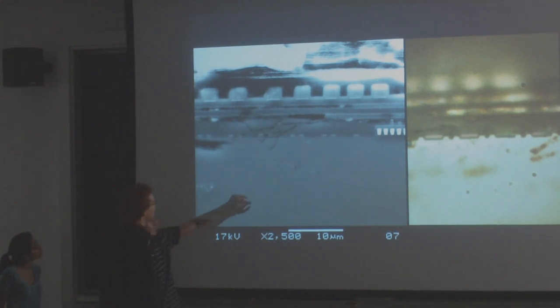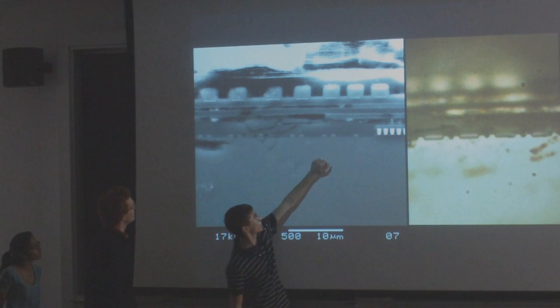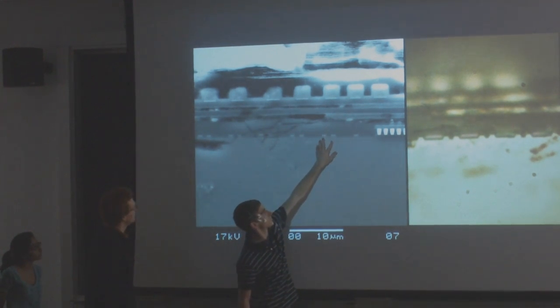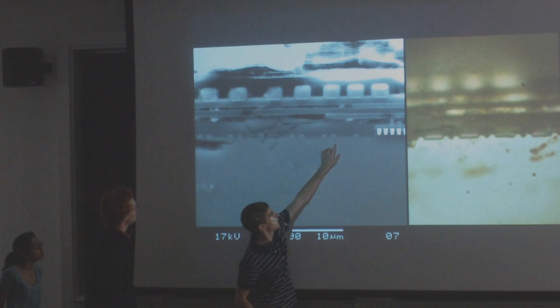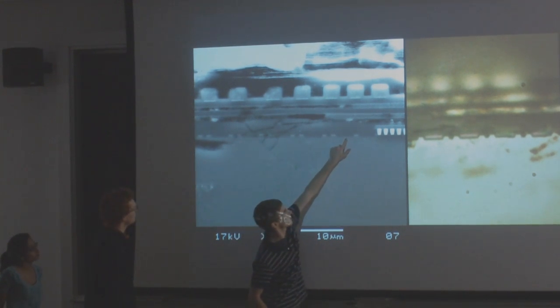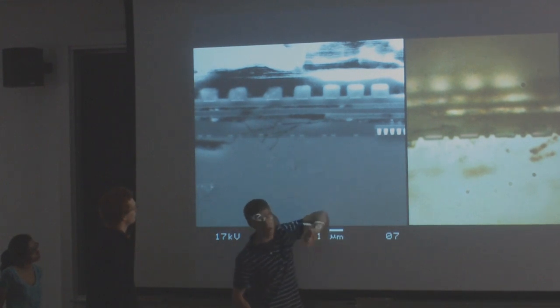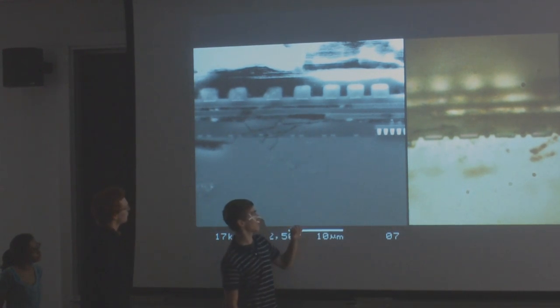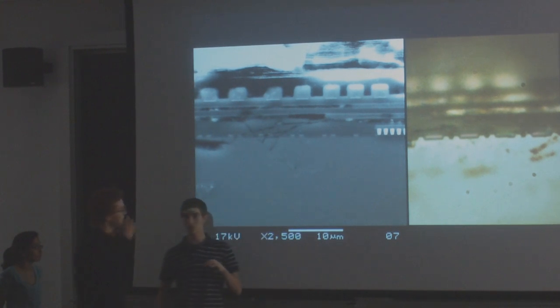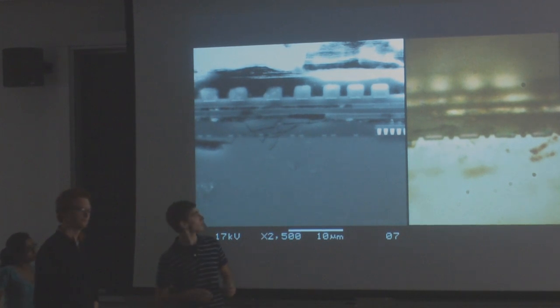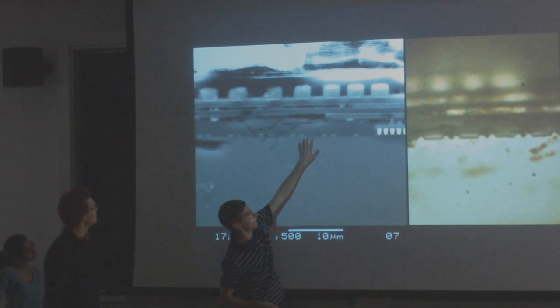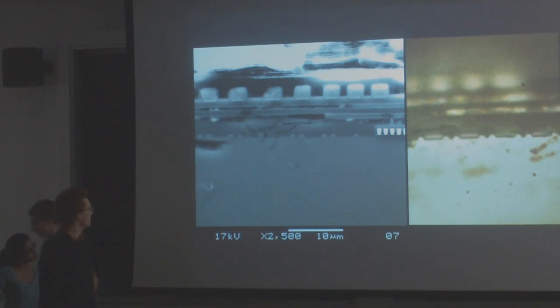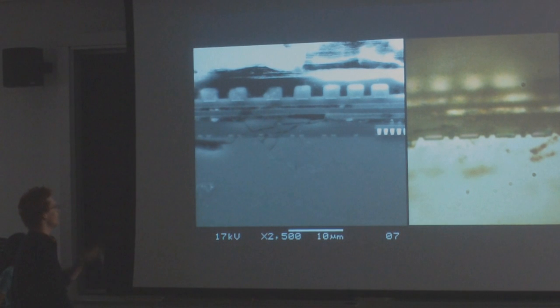One other important thing to note is you can actually see the different doping concentrations. These white areas are most likely wires that are just very small. But then, since this is the body of the silicon, you can see a contrast difference between this and this area here. We're pretty confident that those are n-doped regions. We did some research and it turns out that under SEM, n-doped regions will turn out darker and p-doped regions will turn out lighter. And we'll actually talk about scaling a little bit.